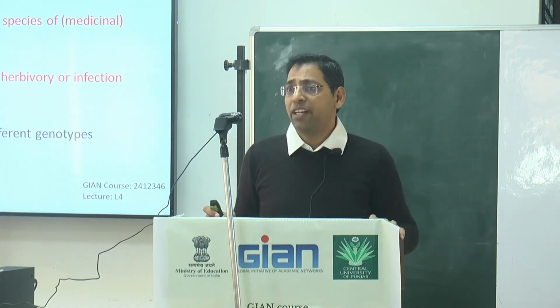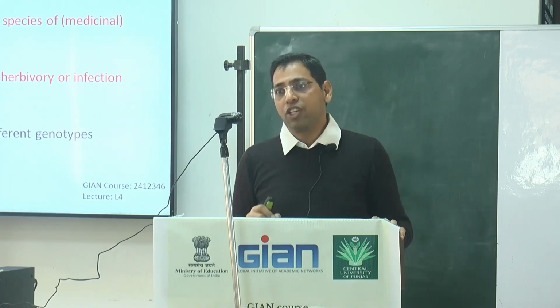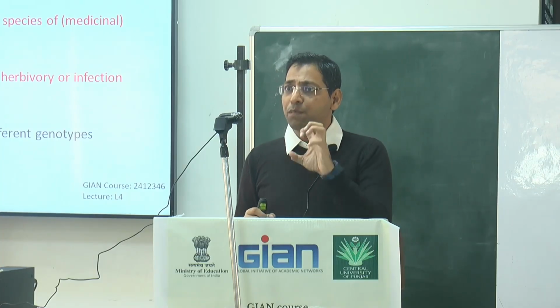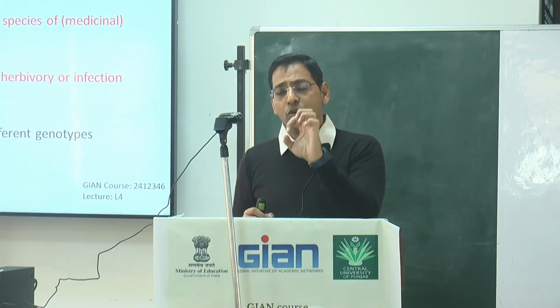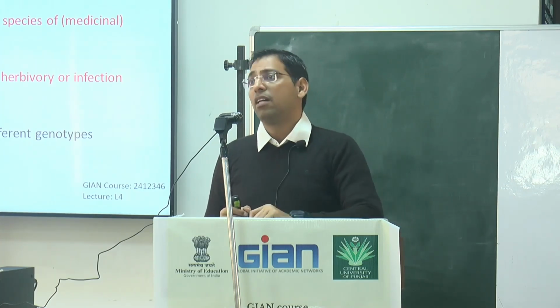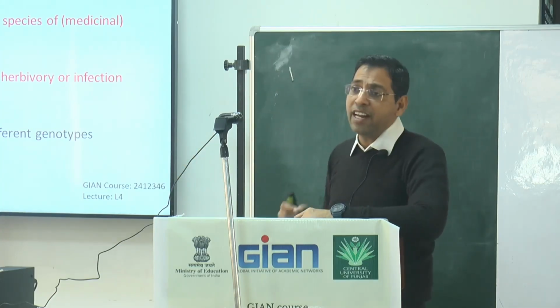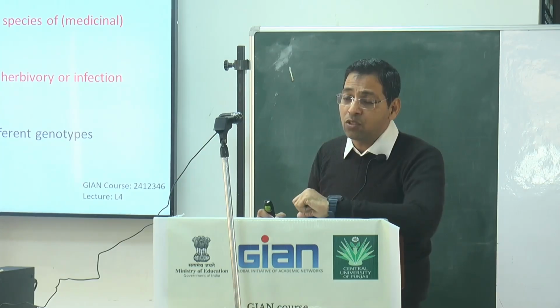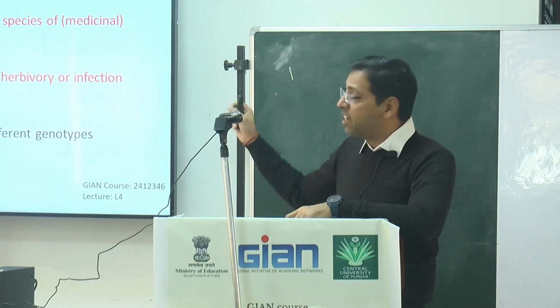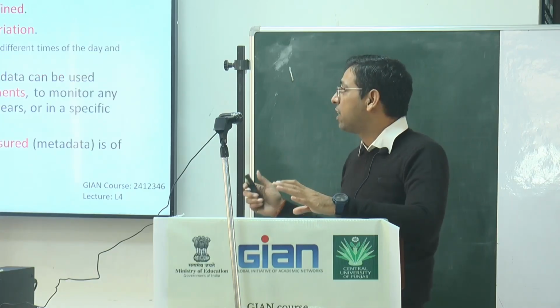Those key metabolites we can label as biomarkers with respect to that particular situation. So biomarkers means something which can be used for the biological variation with respect to another species, cultivar and genotypes. So you can screen and identify those biomarkers also by using the NMR. So these are the three different applications we can use with the NMR technology.